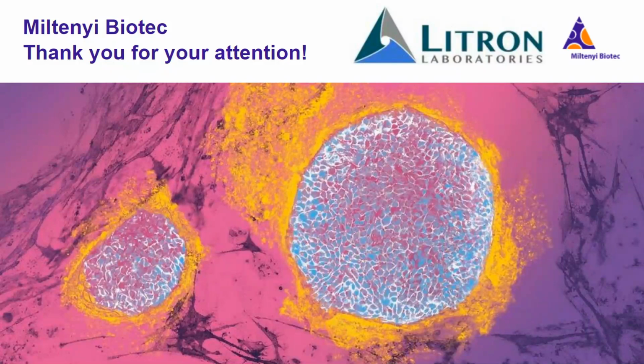And it will physically draw the gates for you, spit out statistics, and spit out a variety of things that maybe are manipulations of that statistic into something as a readout that you may use downstream. So super cool. There's a lot of different ones, but yeah, they fit nicely in this environment.